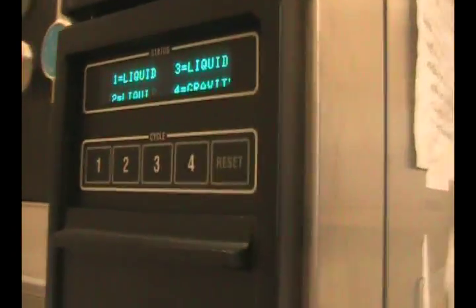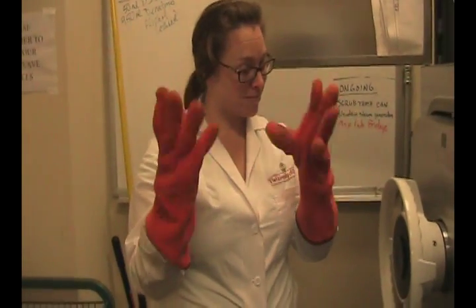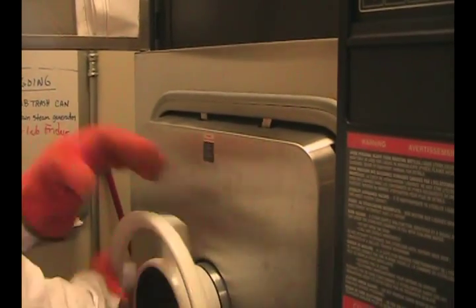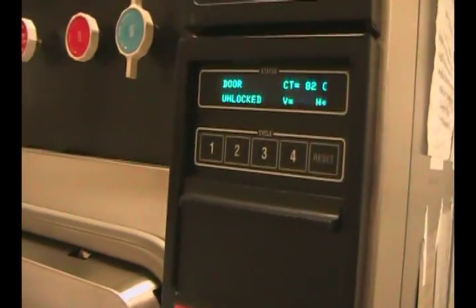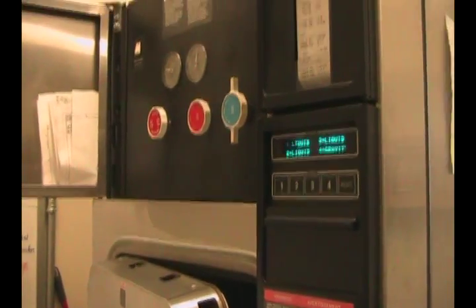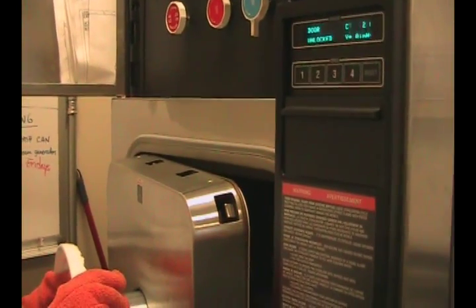Our cycle is complete. Miss Tiffany dons her heat-safe gloves and we can go ahead and begin to open the chamber again. You'll notice it says door unlocked. Make sure whenever you do that to open it an inch and let the steam come out before you try to stick your arms or your face in there.